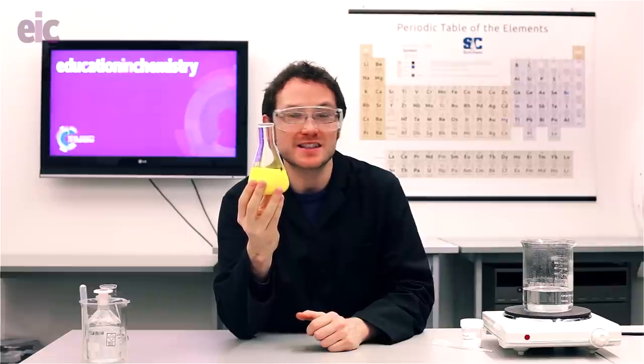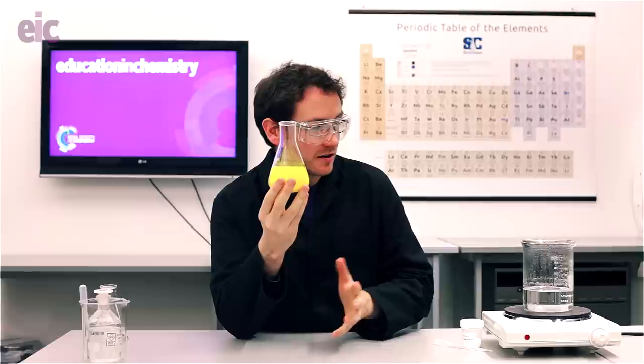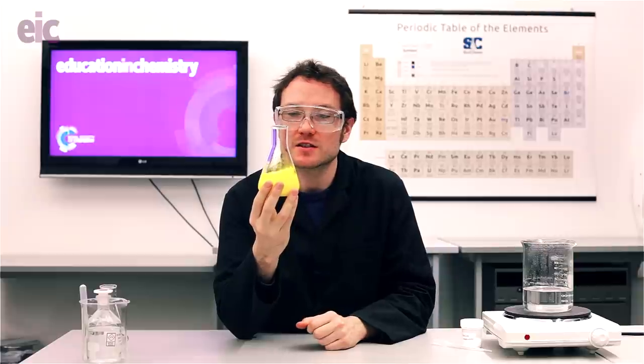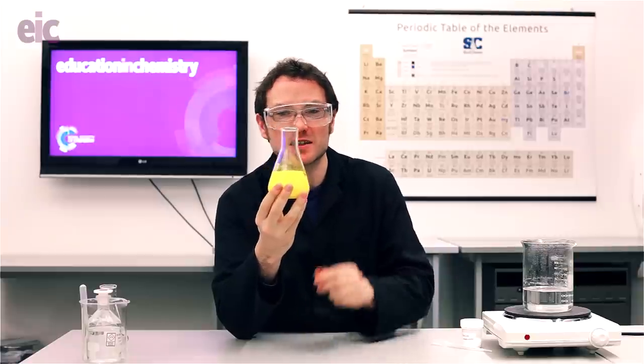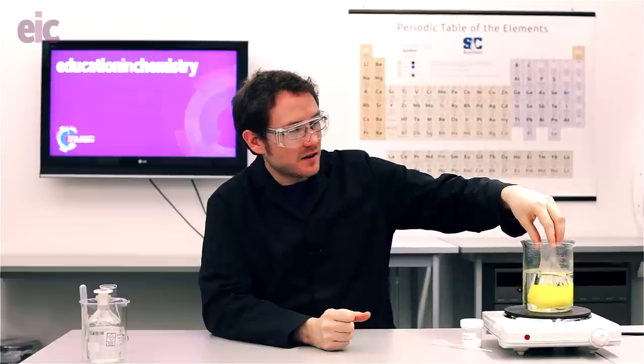This next part is a little bit slower, so it can be handy to have a 'here's one I made earlier' flask nearby. I've got a hot water bath here — the water's just below boiling point — and I'm going to heat up my flask to somewhere between 70 and 80 degrees Celsius. At that point the lead iodide is going to be able to redissolve, and once that solution cools down again and recrystallises we're going to get much larger golden crystals to produce that golden rain effect.